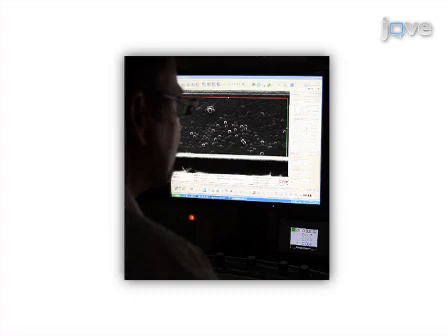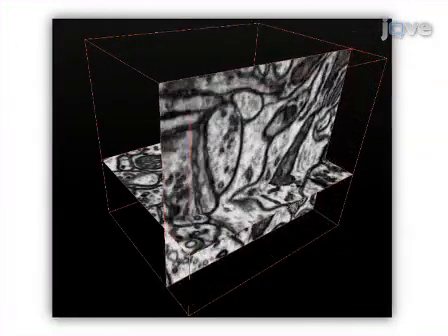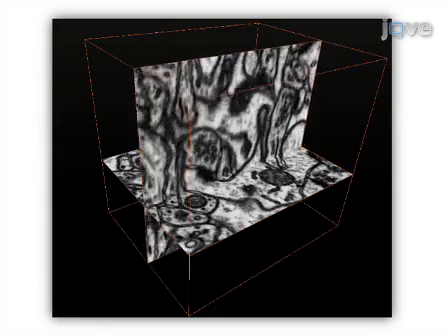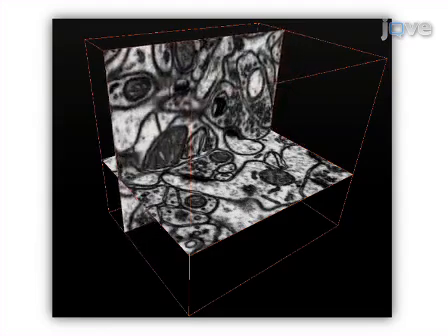The final step is to serially image a face of the resin block using the ion beam to repeatedly remove thin layers prior to each image being taken. Ultimately, results can be obtained that show serial images through a region of interest. The image series is collected automatically, and the dataset typically has isotropic voxels so that the image structures can be viewed from any angle in the stack.